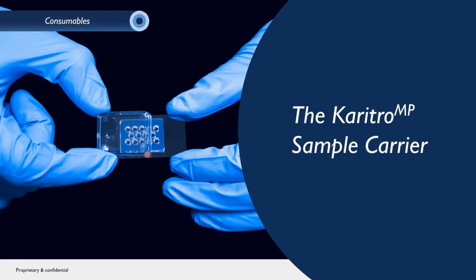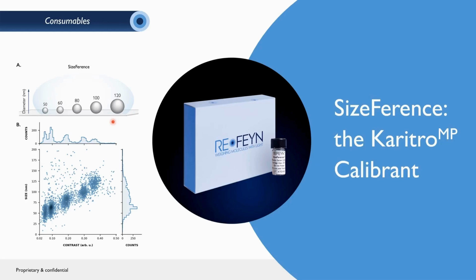Another consumable is Sizeference, which I introduced a few slides ago, which is a mixture of silica beads of different sizes that allows for the calibration of the particle height axis and also for the internal calibration and reference of the contrast measurement.